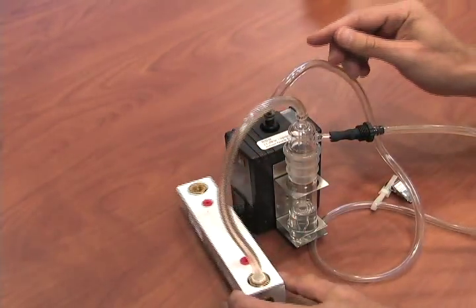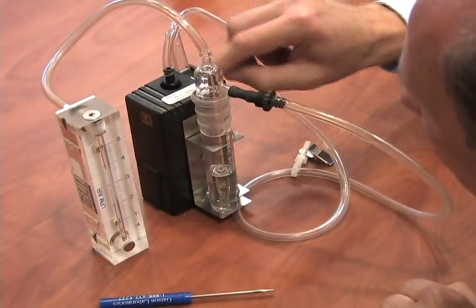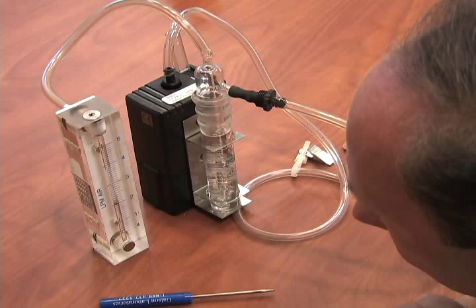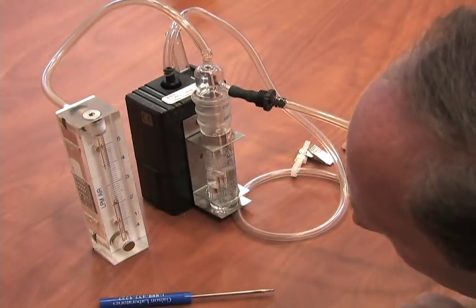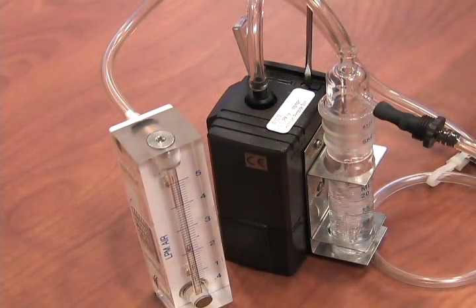Install the rotometer to the top port of the impinger. To begin calibration, turn on the pump. With everything sitting on a level flat surface, check the ball float in the rotometer. Be sure to take your rotometer reading at eye level and use the center of the float for the value. If you need to adjust the flow, use the set screw on the pump.